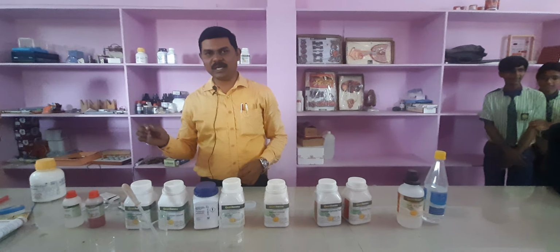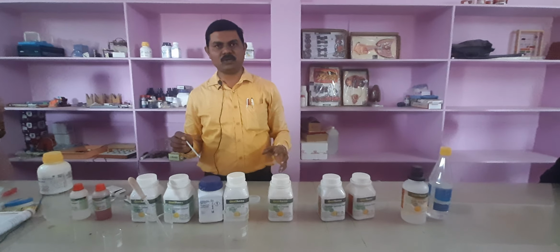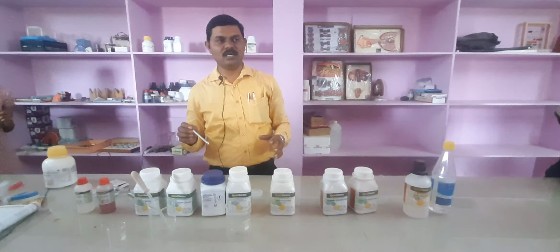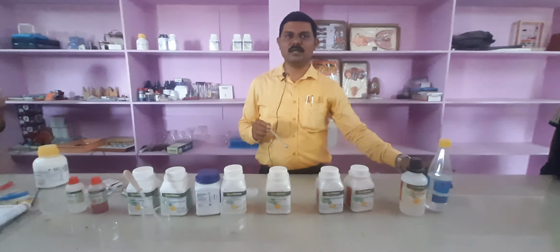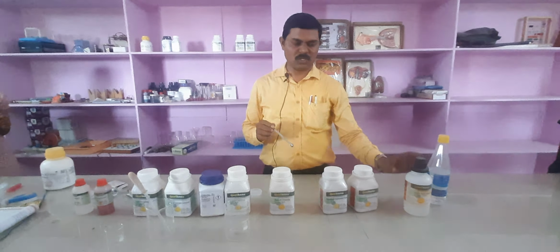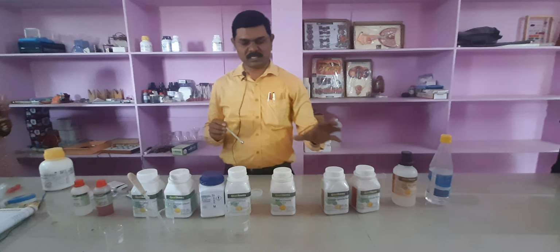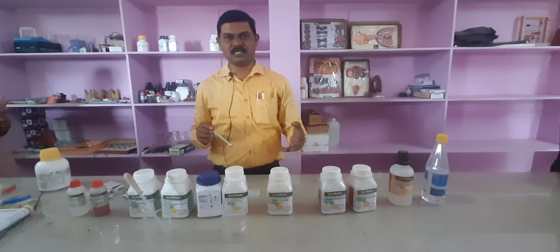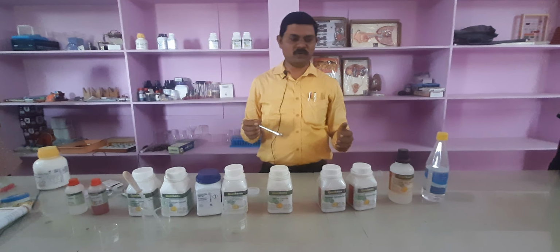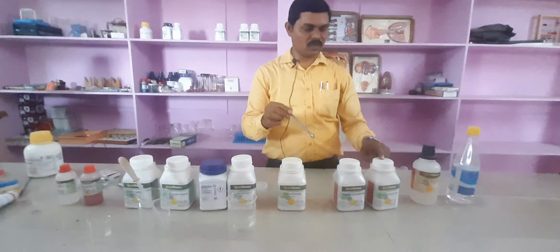Dear students, today we are going to learn some activities related to acids, bases and salts. In 10th class, this is the third lesson. Most of the children may know the formulas, but they may not know how those are acids, bases, salts, whether those are solids, liquids, gases. But now I am trying to show you some of the acids, bases, salts. So let us see now.